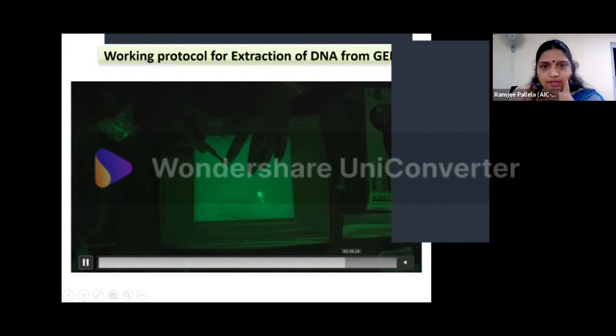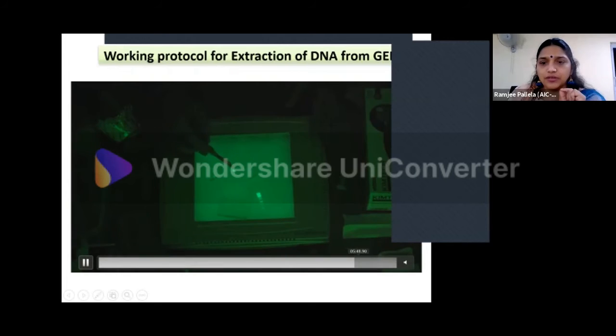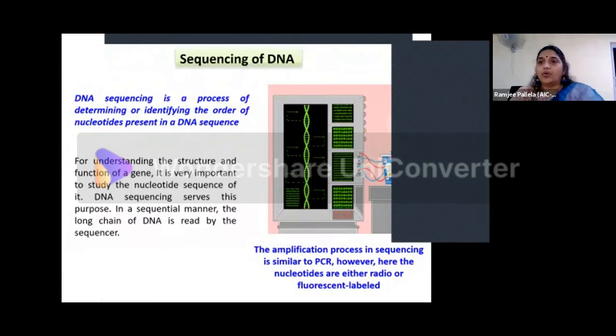This is very beautiful. See, the complete DNA that was there in that particular amplicon is here now. So now we take it and we melt the agarose and elute this DNA in our TE buffer. Okay. Now, we have this DNA in our hand. We have the DNA PCR amplicon in our hand.